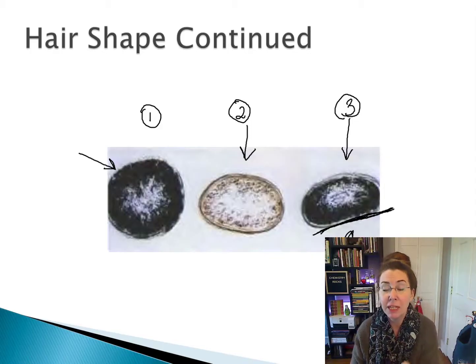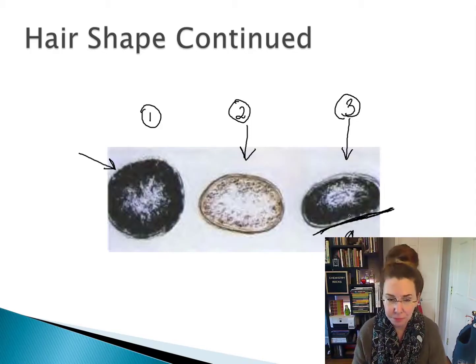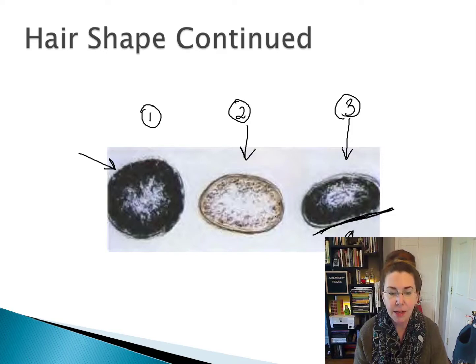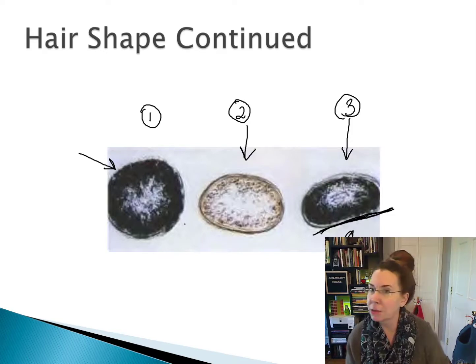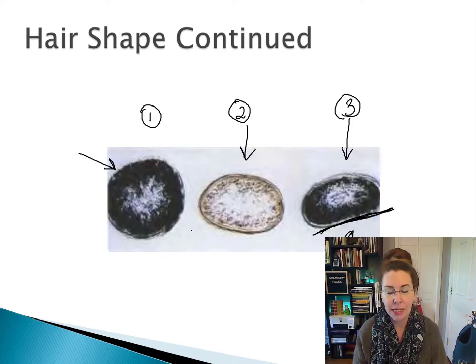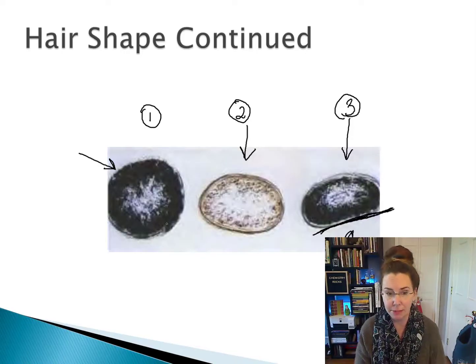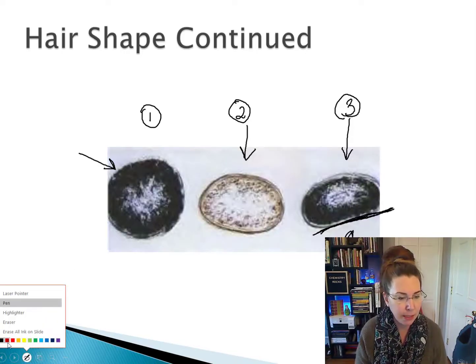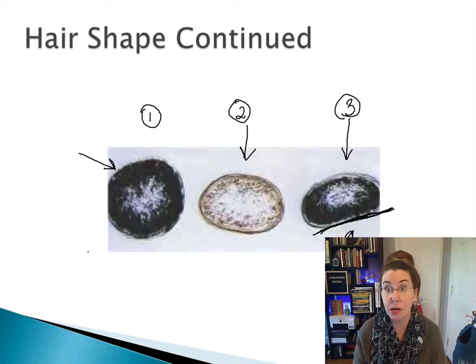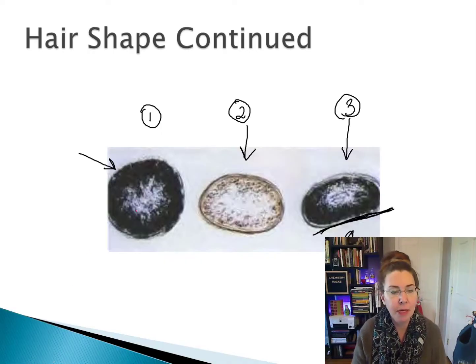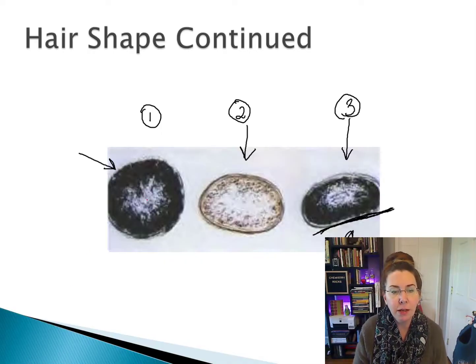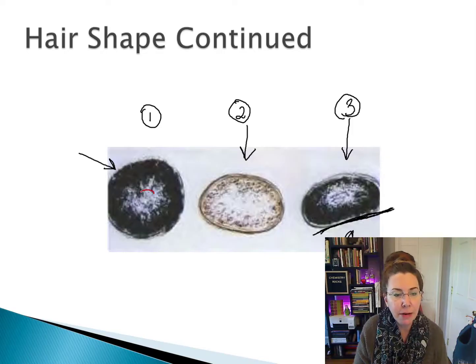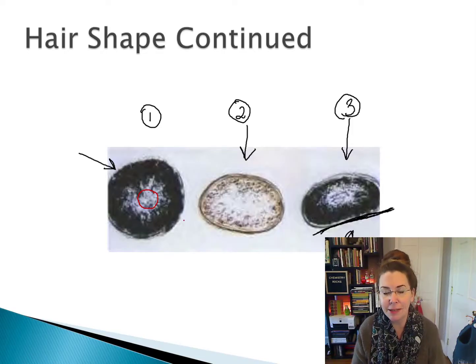So this curl would form in a downward direction. The other thing to point out on these hairs is the density of the melanin, which is something you can really only see in cross-sectional shape. If we look at this first hair, we have very, very dense melanin. The area of clearness in the center is actually where the medulla is.